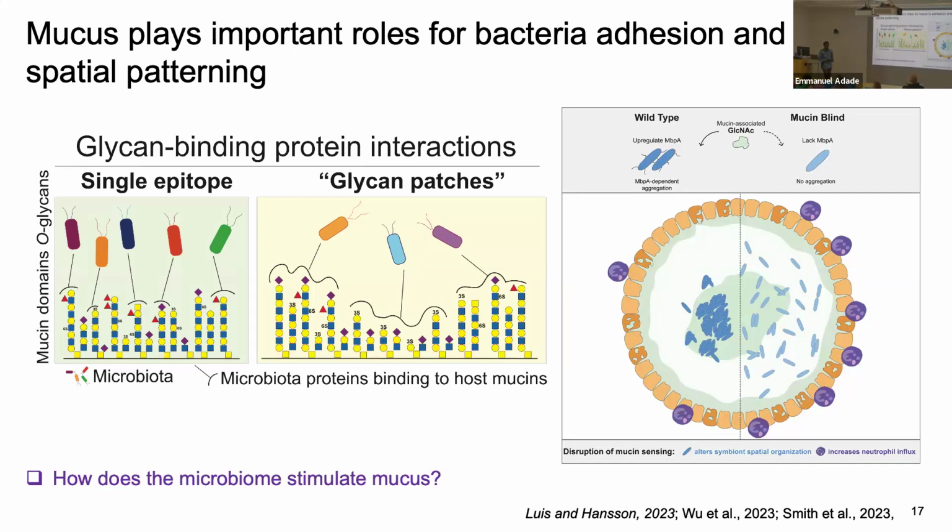It's a good question, right? But I don't know how to advise for sampling, because one big part is fixation, how you fix a sample before you apply the fluorescent dyes. I had to troubleshoot a lot on fixing the zebrafish in a way that the gut content is preserved and the mucus is not degraded. We think about the method of fixation as one of the really critical steps. And with a rumen, you're definitely going to dissect the gut. Think about how it's going to fall apart. You don't want it to fall apart.